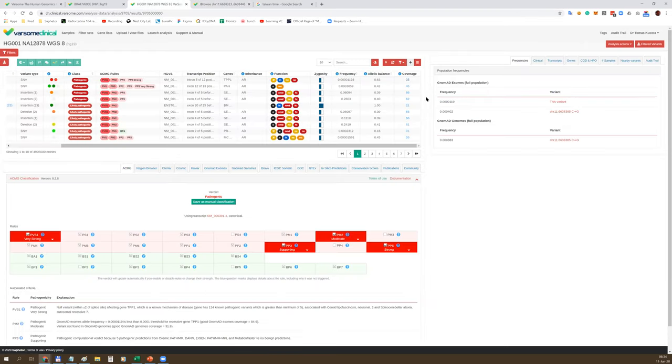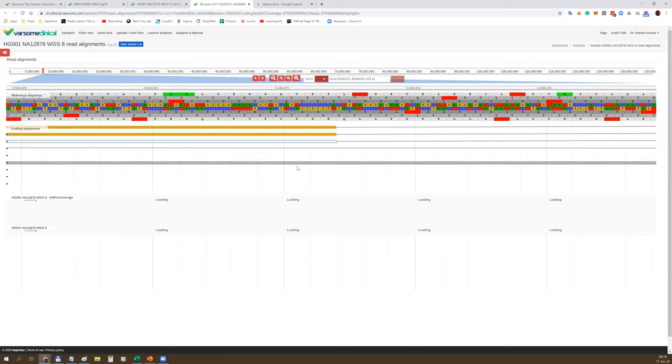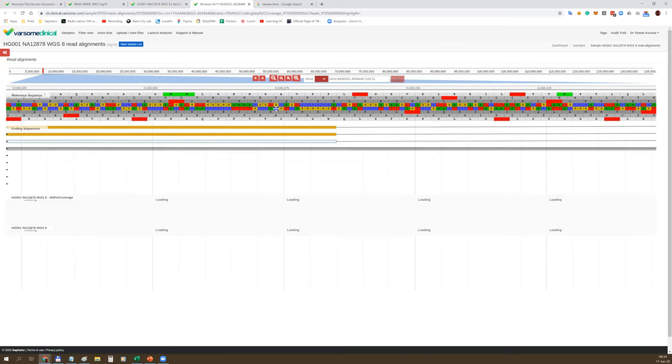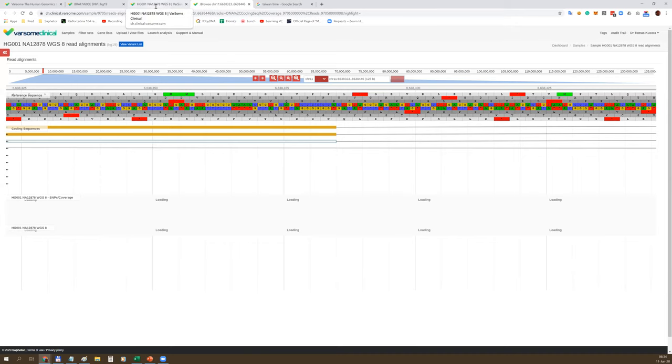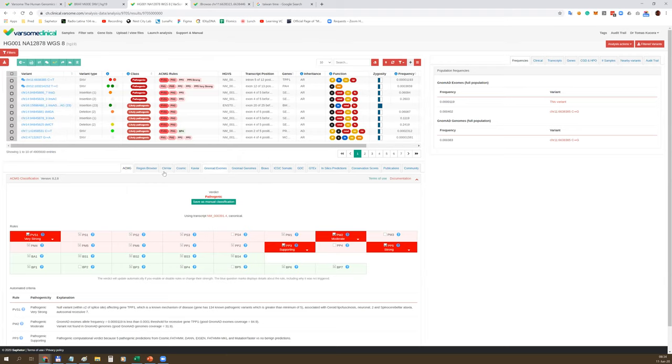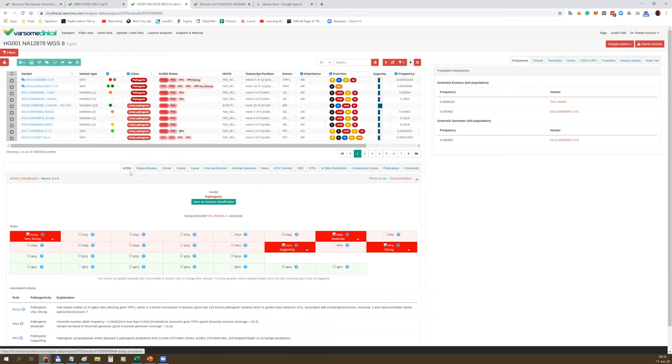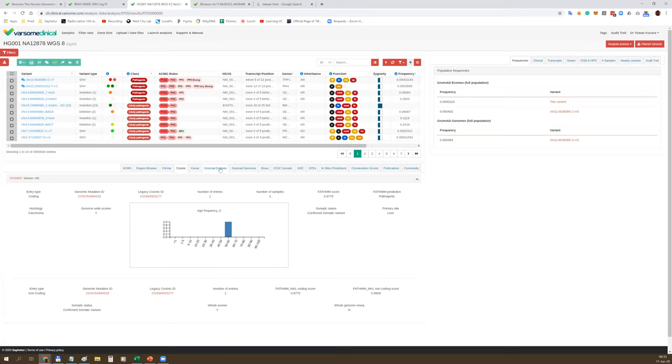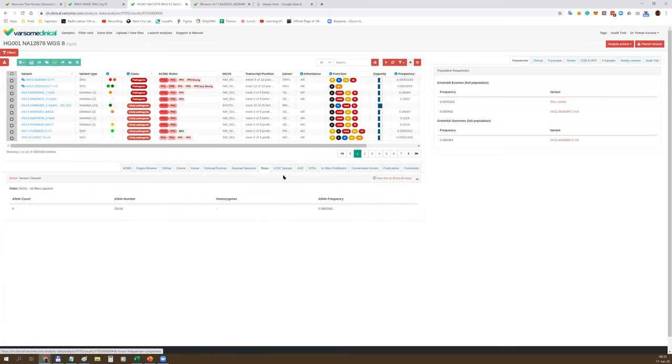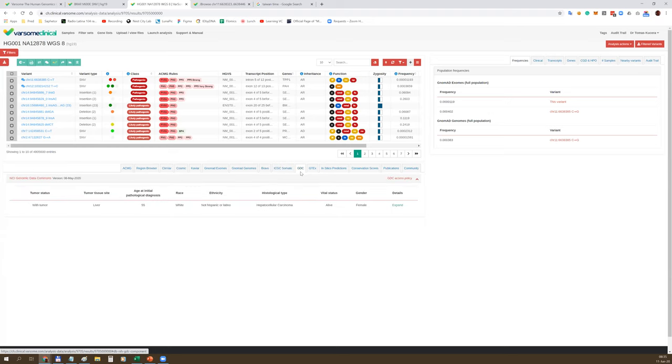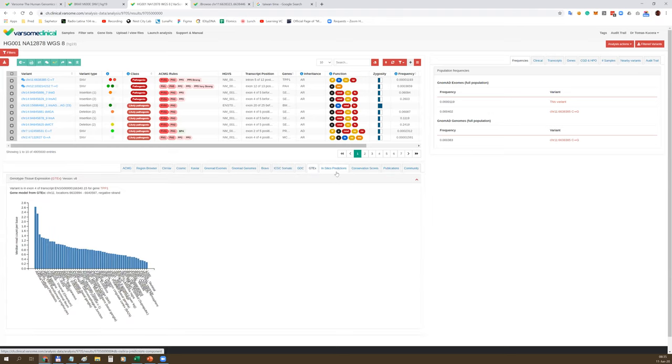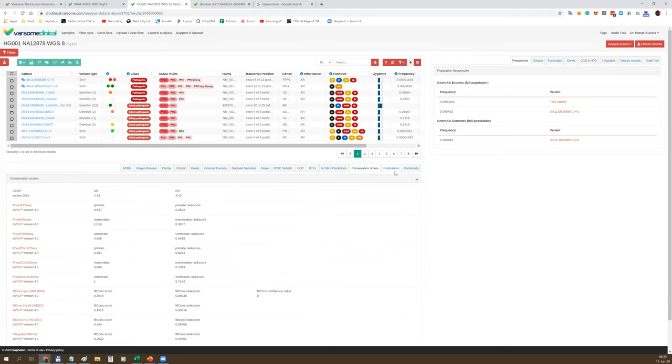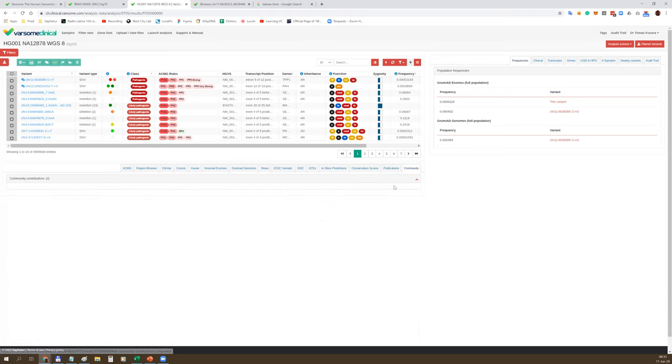Whether it's coding, missense, splicing variant, zygosity, population frequency, allelic balance and coverage. Coverage is a link which, if you click on it, takes you to the JBrowse where you can see the graphical representation of reads. IGV is also available as an option. Around the variant table, you can see all the annotation data coming from all these 70 data resources. Here you can see the first set of tabs with ACMG criteria, the region browser, ClinVar entries, Cosmic entries, population frequencies, somatic data resources.